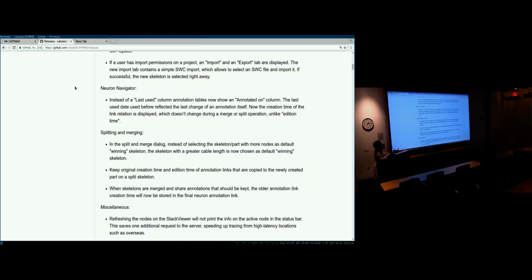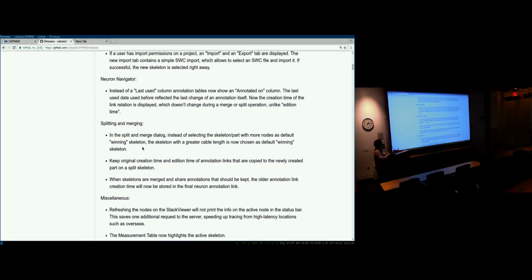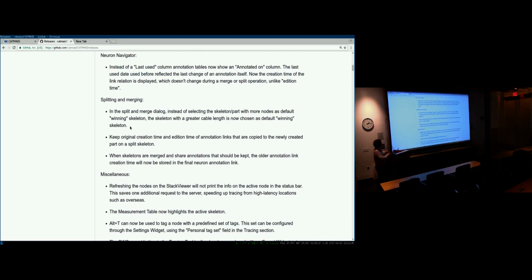Okay, next also. So when splitting, well, let me just read what I actually wrote there.